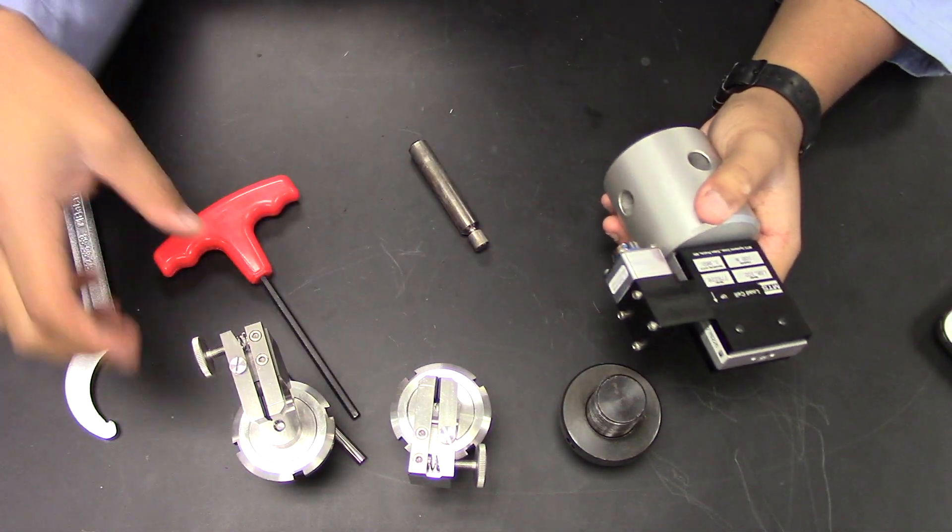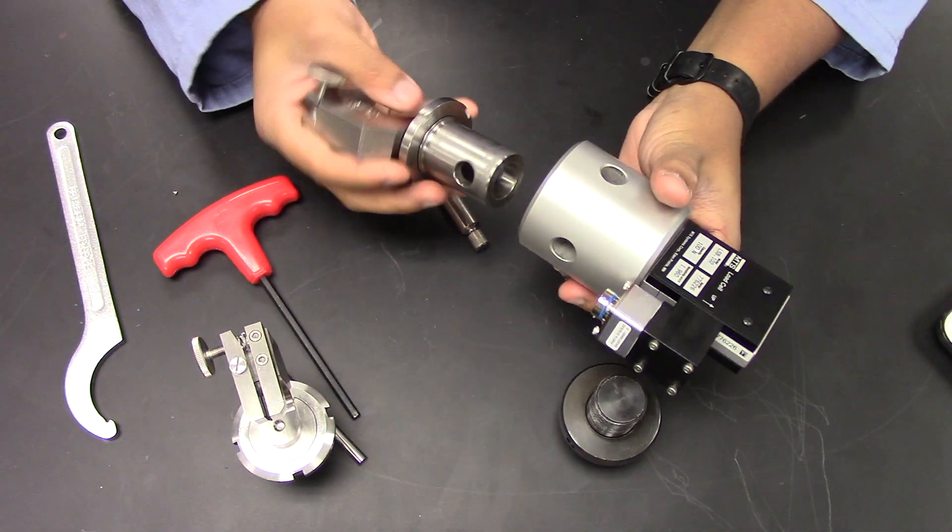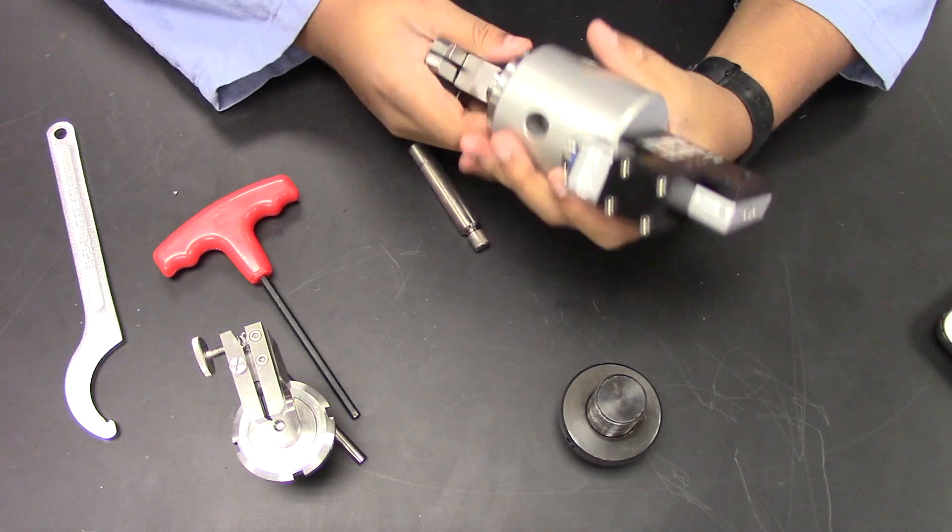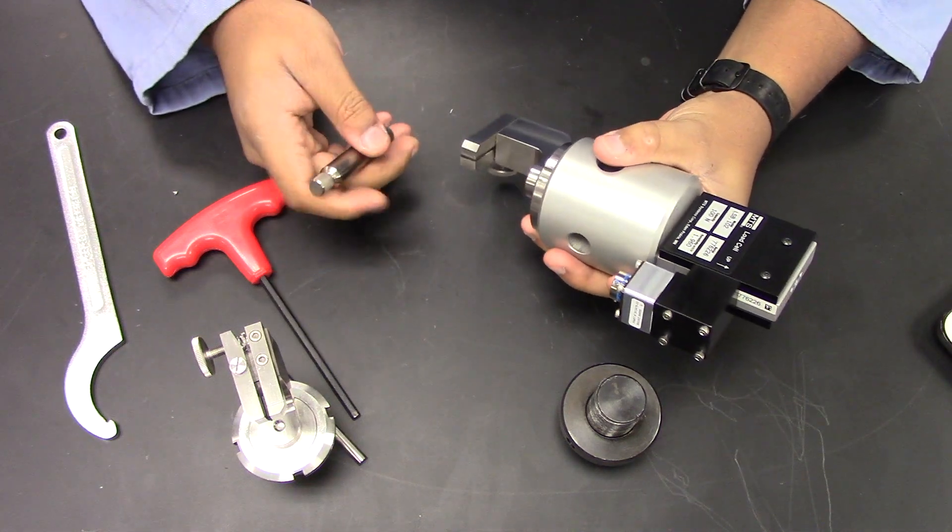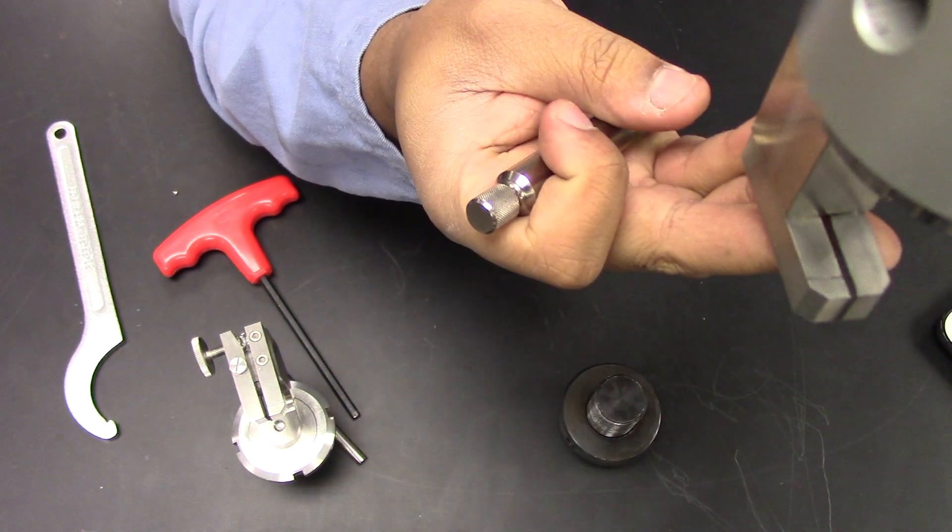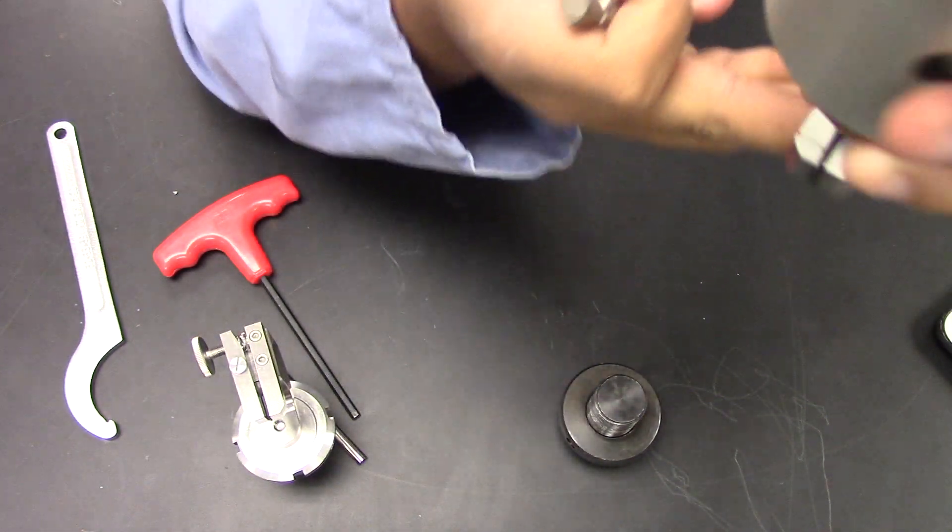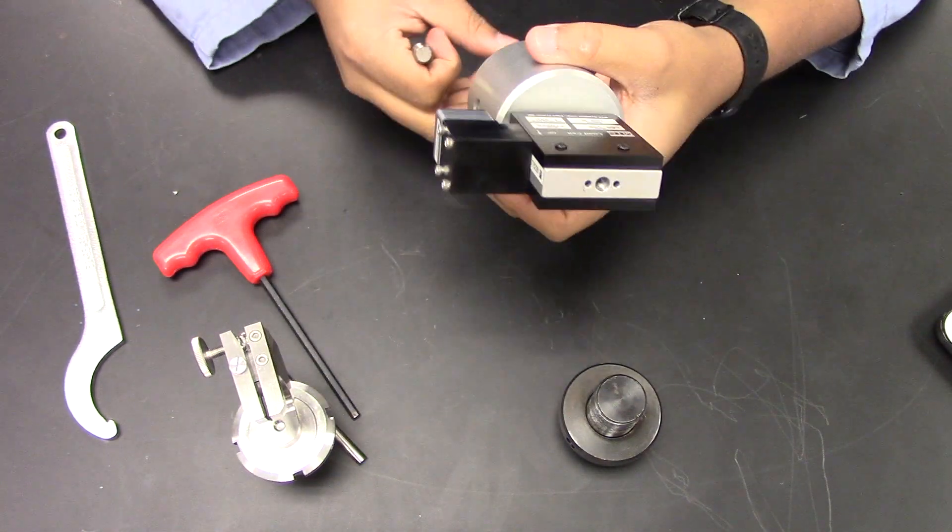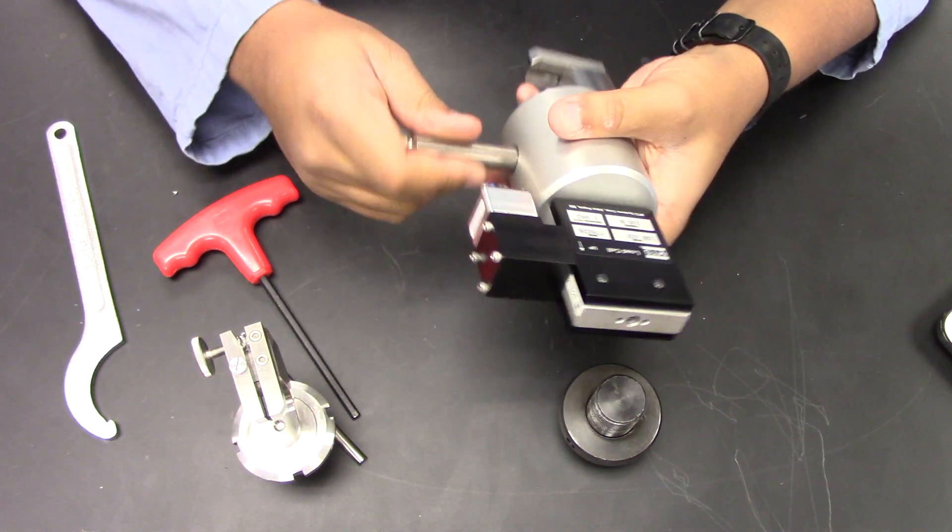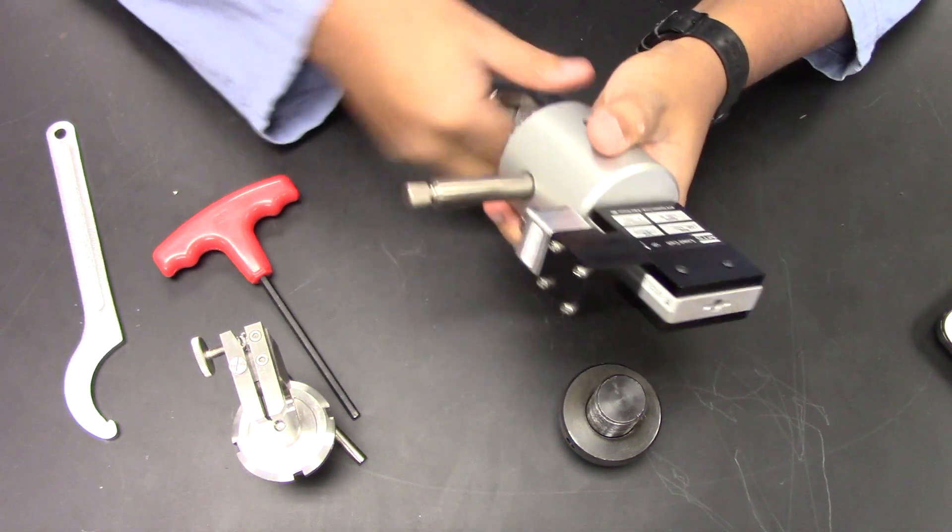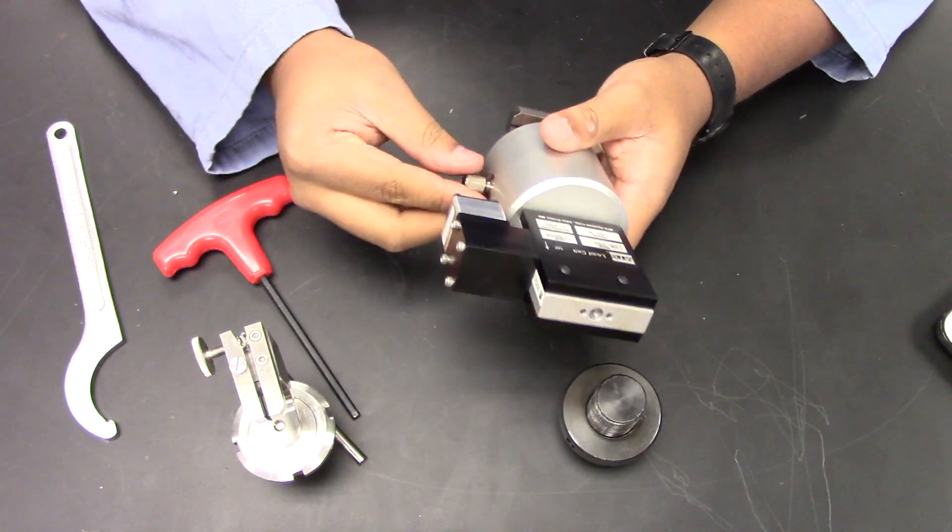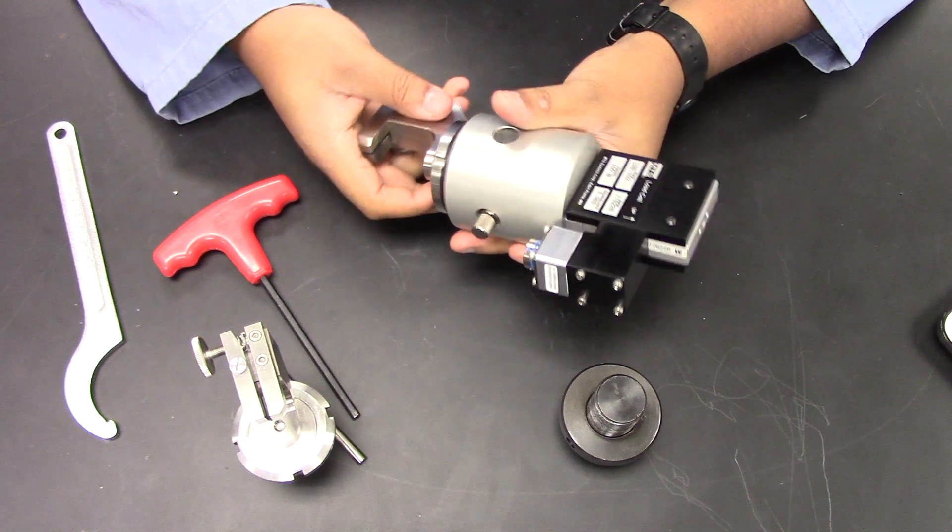Once that is secure, I'm going to insert my grip. Note that with this particular grip, I'm going to orientate it such that the right side, which you can see right here, has a line indicator. So make sure that that indicator is facing you. And then insert your pin. And now you've attached your grip to your load cell.